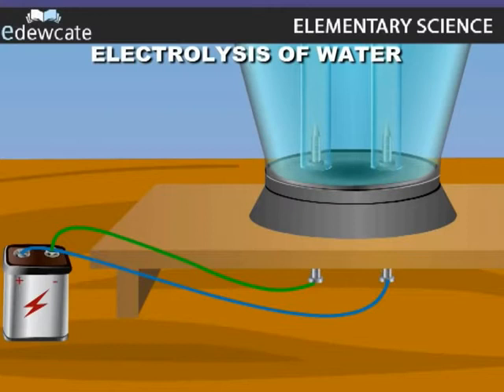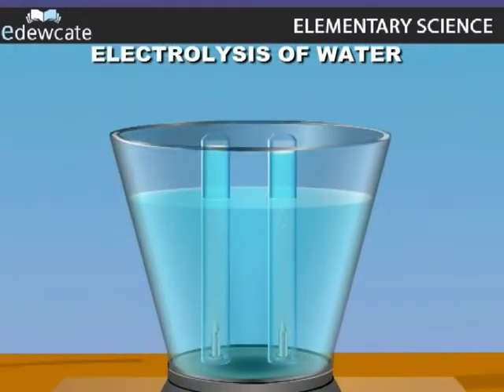Connect these outer electrodes to the positive and negative terminals of a battery. You can see that gases are produced in the two test tubes. After 30 minutes, examine the volume of each gas formed. Are the volumes of gases equal?